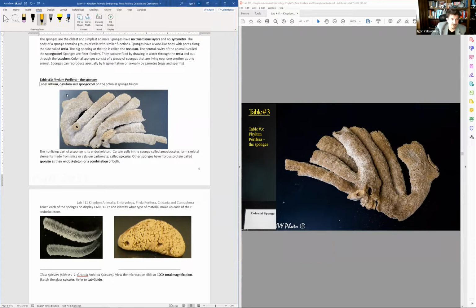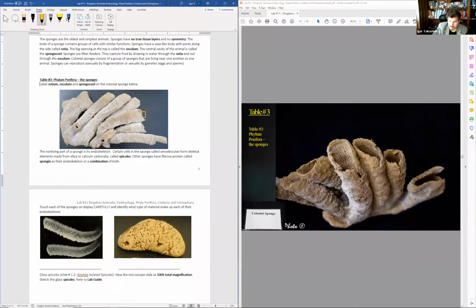All right. Now, osculum, that particular part right there, the opening where the water comes out. That's the osculum. And if I cross-section the tube, here we go. Those particular openings are osculum. This is one sponge. This is another sponge. Third, that's a colonial sponge.